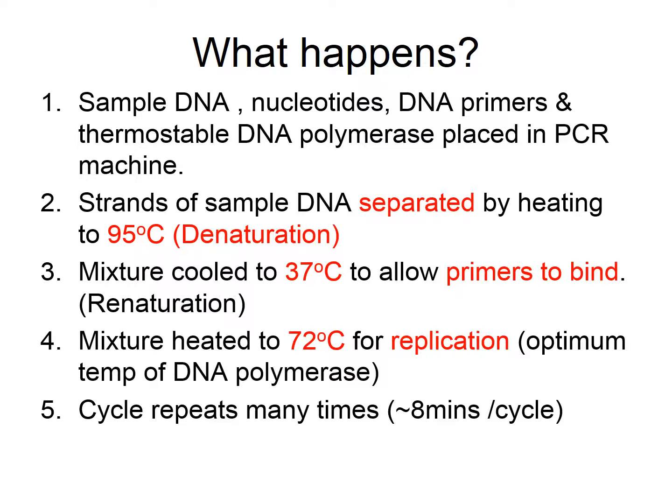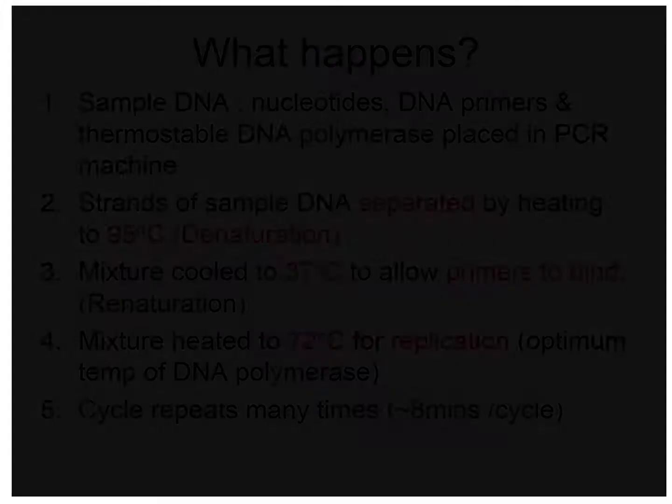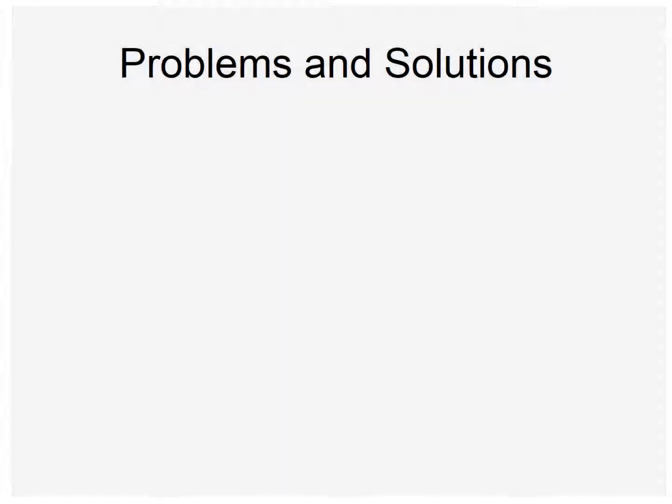So this cycle goes on, and it takes about 8 minutes to complete one cycle for the entire genome to be copied. 8 minutes, huh? That's an amazing number of nucleotides being used, and the ability of this polymerase to correctly copy them. It's fantastic. There's a small video which I would be giving links to, which you should view later on after the completion of this particular presentation.